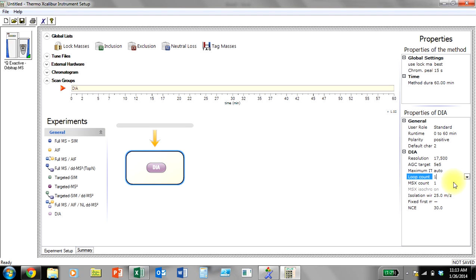More complex experiments can be done by using multiplexing and breaking the windows into subsequently smaller windows to get not only a more complex experiment but better data, but we'll not go into that here. Simply, we're going to do the experiment in 25 Dalton windows, and we'll set the first mass in the low range. I don't think very much usefulness is going to come out of the extreme low end in this type of experiment. Then normalized collision energy would be what is appropriate for your Q-Exactive.